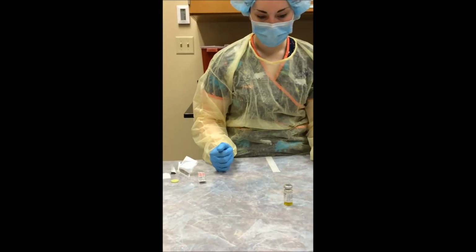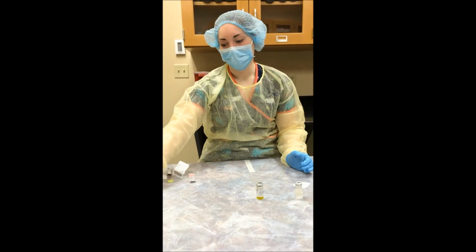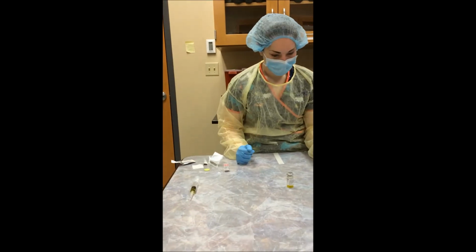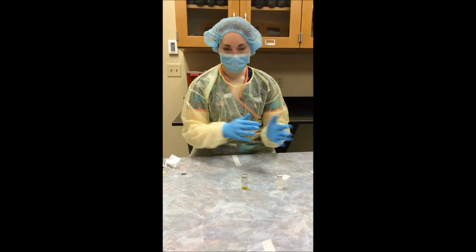So now you would just clean your area. When you dispose of your needle, you'd put it in a sharps container, and you would wipe down your work area and you'd be all set.